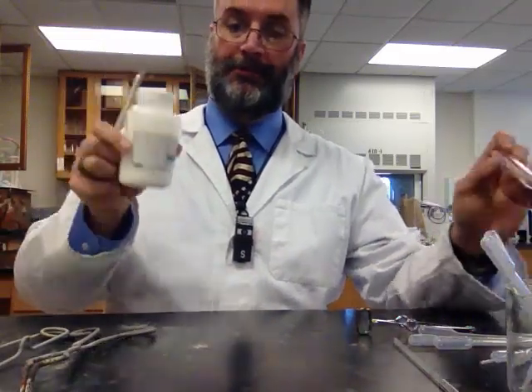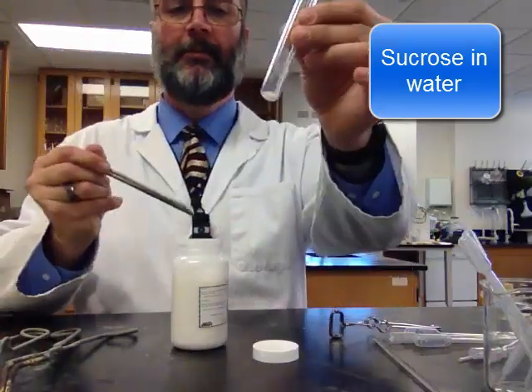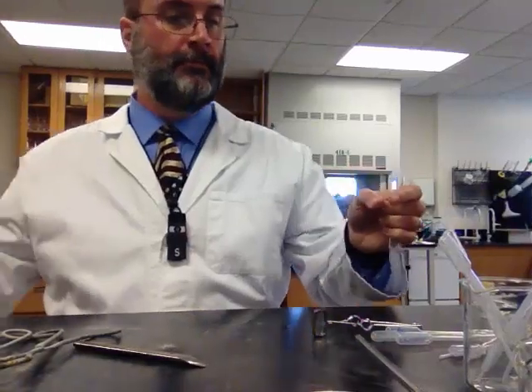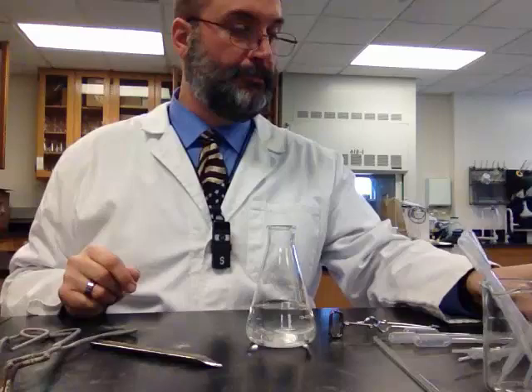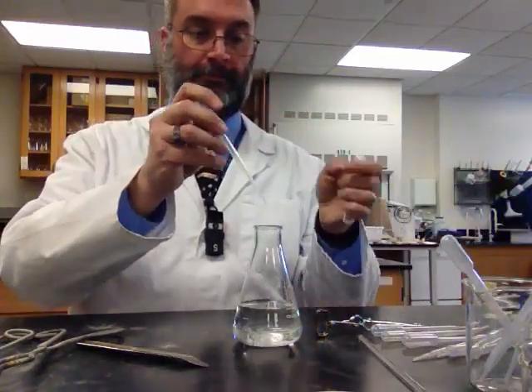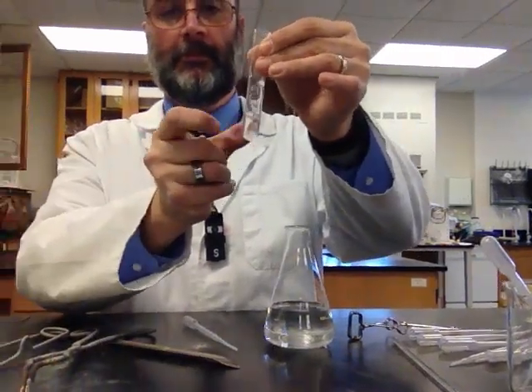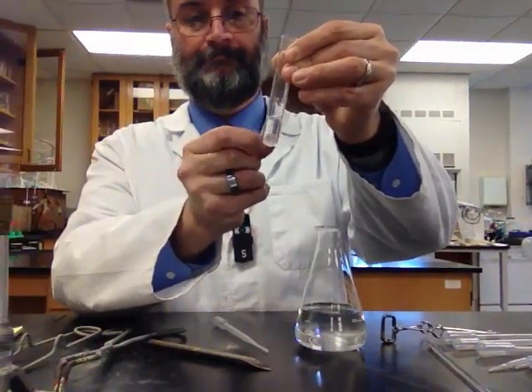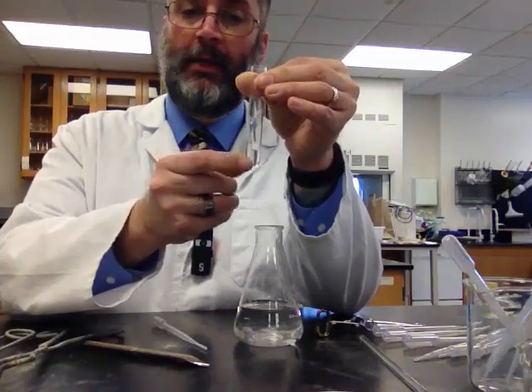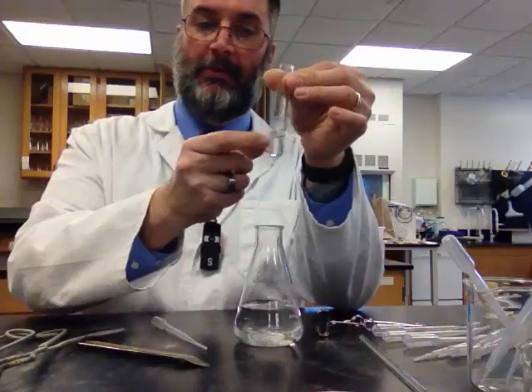Next one. Sucrose. Table sugar. White crystals. Some water. Mix it up. By the way, if you want to mix something in a test tube, this is the proper way to do it. Instead of putting your thumb over and inverting it, because if there's something in there that you don't want on your skin, you obviously don't want to put your thumb over there. Flicking mixes it up real well.